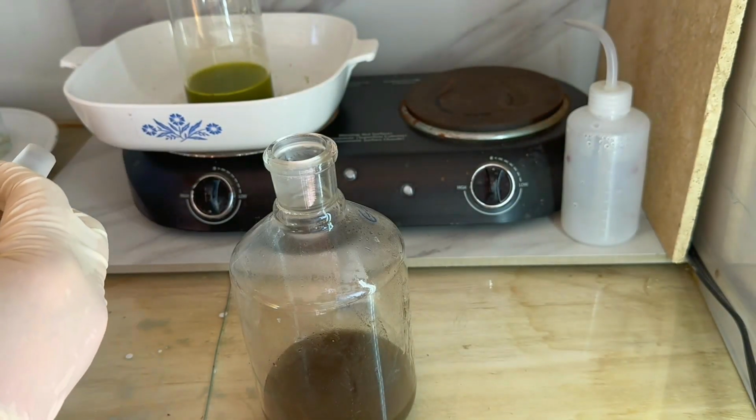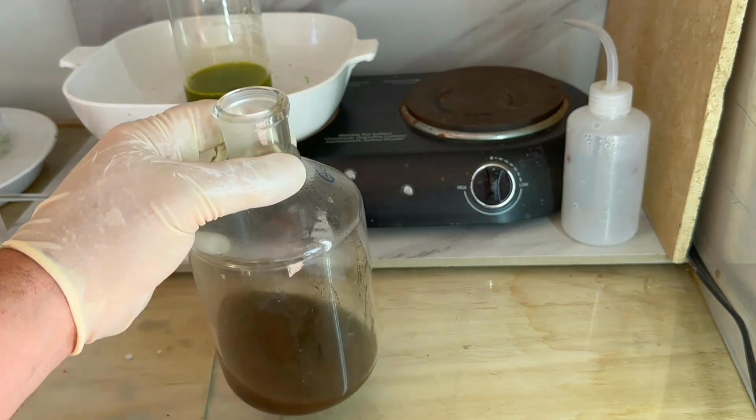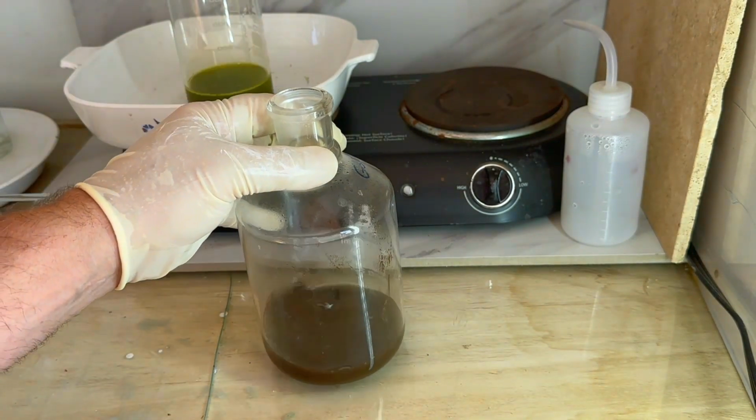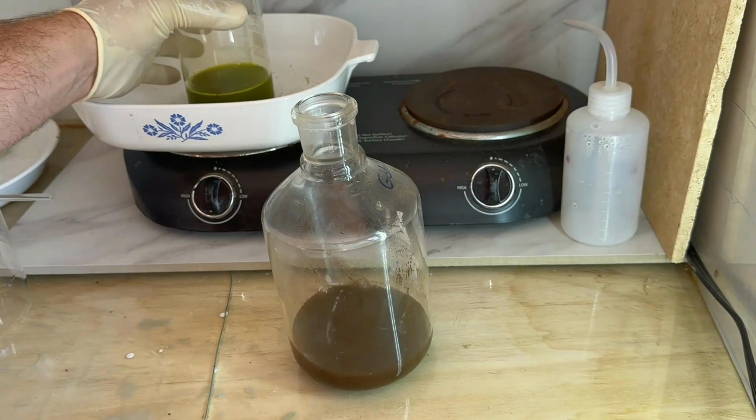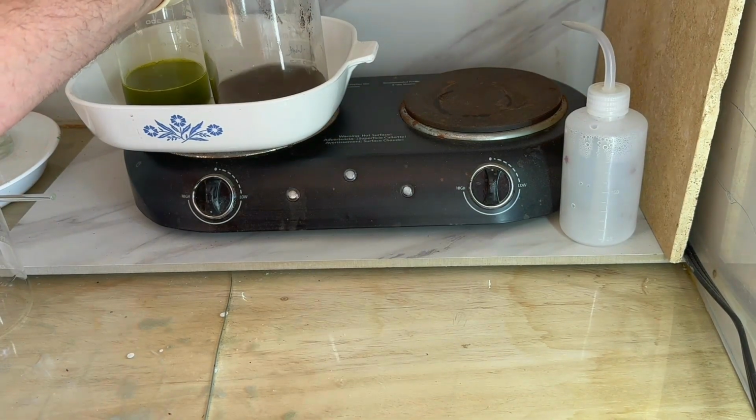All right, that should do it. So we'll go ahead and get this, give it a little swirl. We're going to add it up onto the heat as well. We'll just put both of these in here and let the Aqua Regia work its magic.